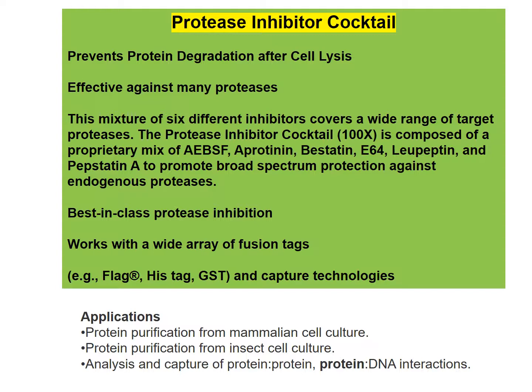And there are the 6 mixes here. I know I've used leupeptin and pepstatin, but again, they are broad spectrum, so this mix may not work for your cells or conditions. Of course, the company says they're the best in class.